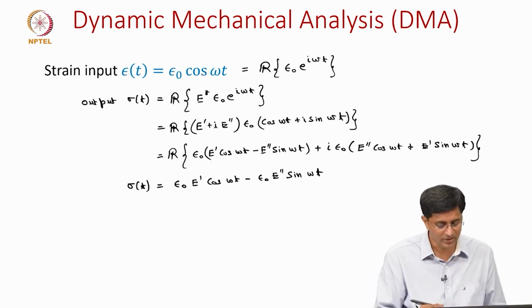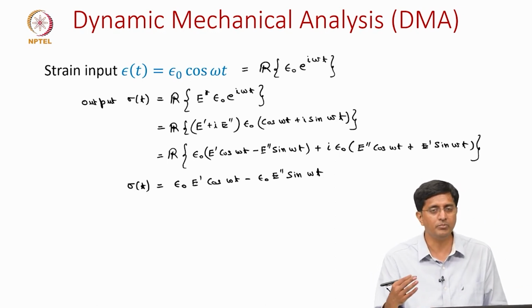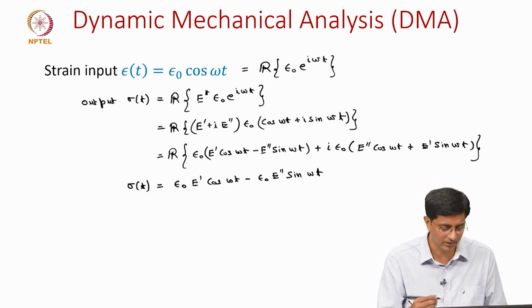But having found this, now let us see how do we bring in the phase lag or the delta.